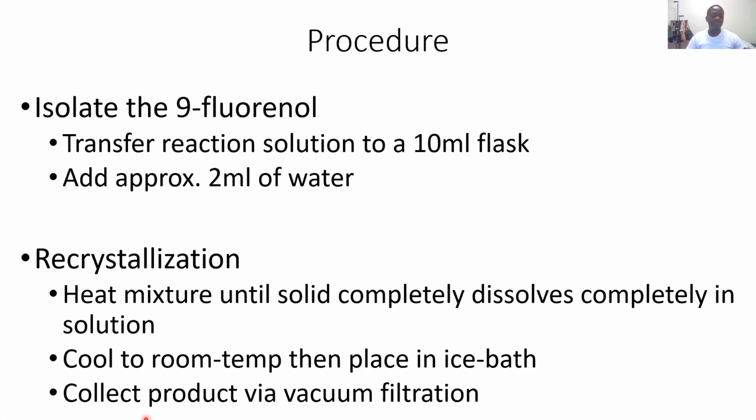So what I'm saying is when you have a compound that's a solid, and it has a little bit of impurities in there, and you want to recrystallize, your impurities have to be soluble in the solution you want to recrystallize in, both when hot and when cold. However, the main product, your pure compound you're trying to get, is only allowed to be soluble in the solvent when it's hot, not when it's cold.